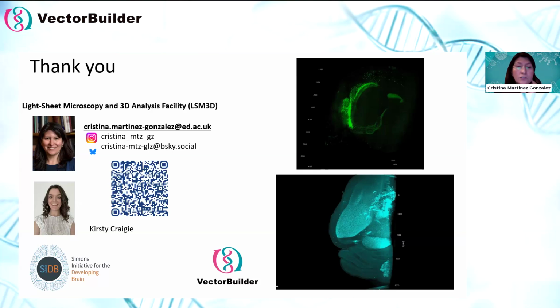Overnight post fixation is not a problem for parvalbumin, GFAP, GFP, not an issue, but over cross linking, it can affect. So I would say reduce the fixation times to test what would work best. Perhaps only 1 hour, perhaps 3 hours, but not overnight, perhaps would be ideal. Yeah, that makes sense.